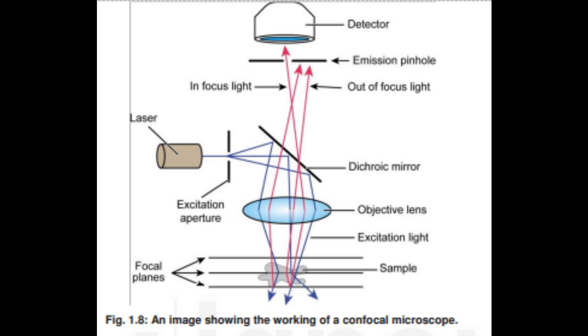1.2.5 Confocal microscopy. Confocal microscopy is an advanced microscopy technique which uses a pinhole to eliminate out-of-focus light. Discrete optical sections can be collected after eliminating out-of-focus light above and below the plane. High power lasers illuminate the sample. They help in collecting light from the desired focal plane. The beam of laser light gets scanned across the sample, and light only from the desired focal plane can enter the detector.